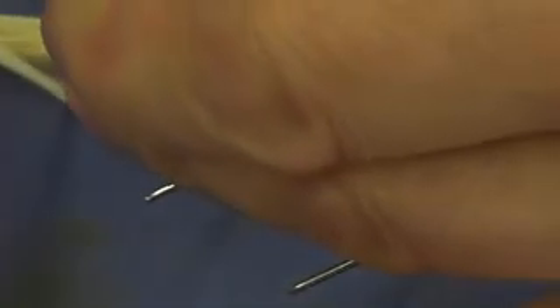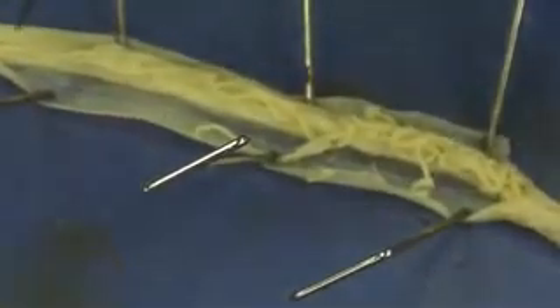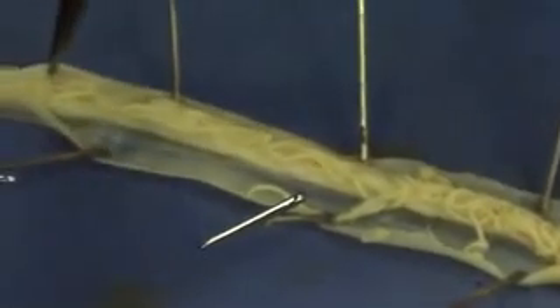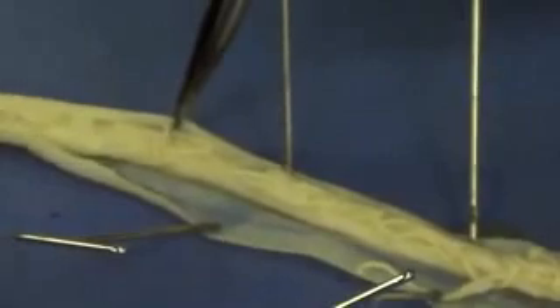Being careful not to damage the internal organs. As we're going to see, the roundworm is pretty much set up to do two things: eat and reproduce. So most of the structures we're going to see have to do with digestion and reproduction.